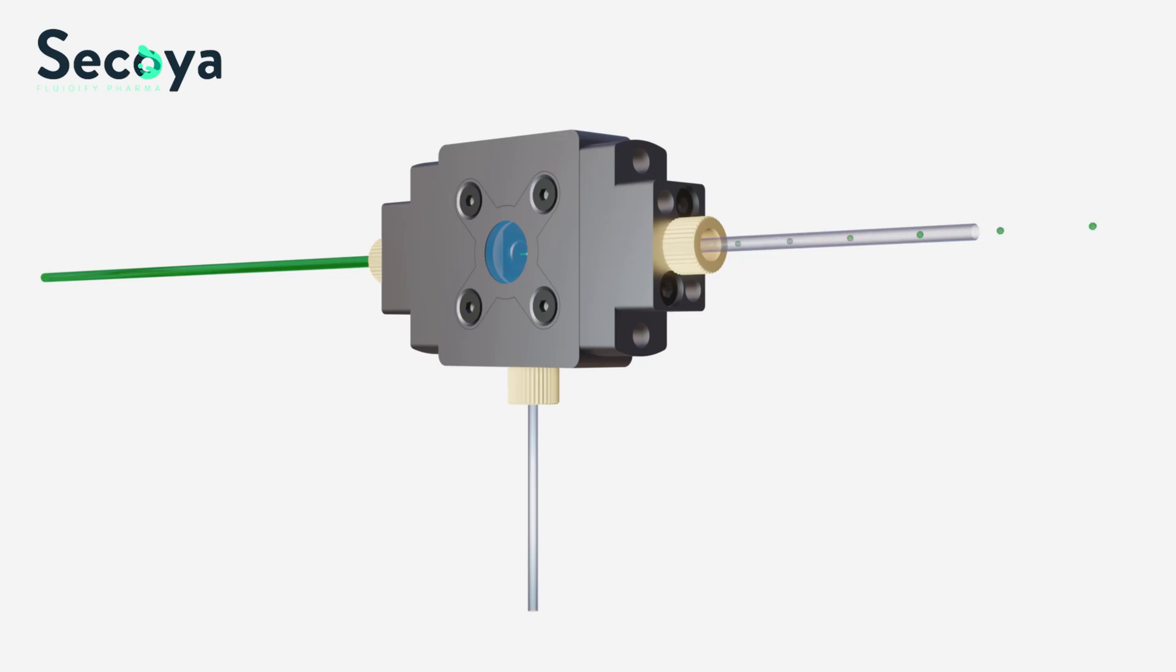The emulsion is transported out of the device through a tubing connected to the outlet insert.